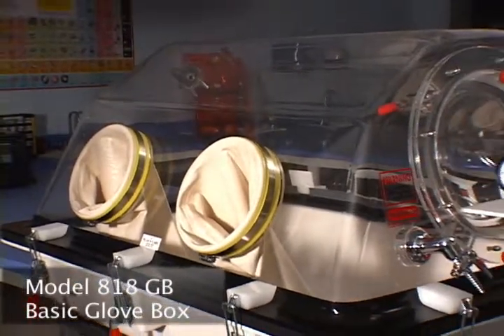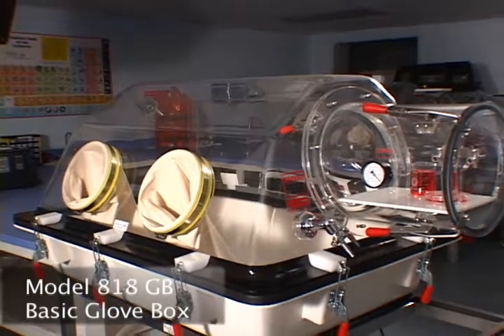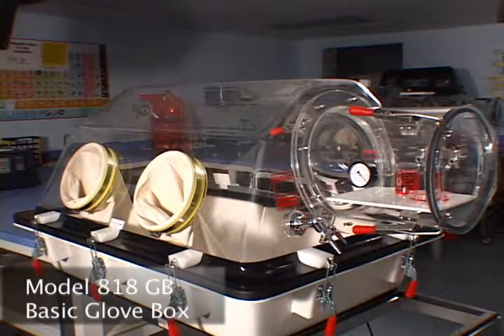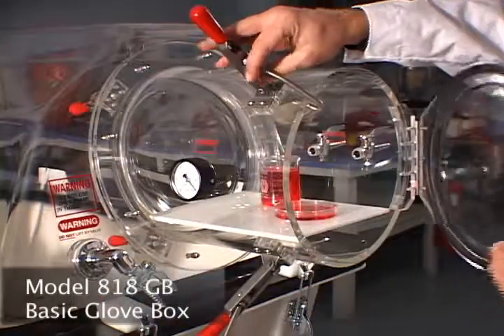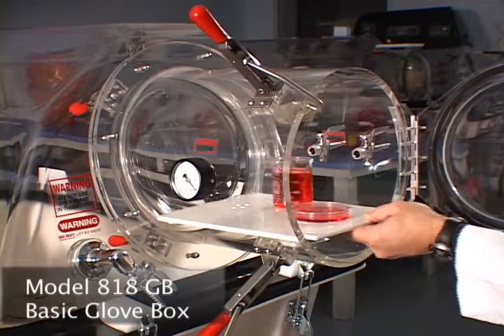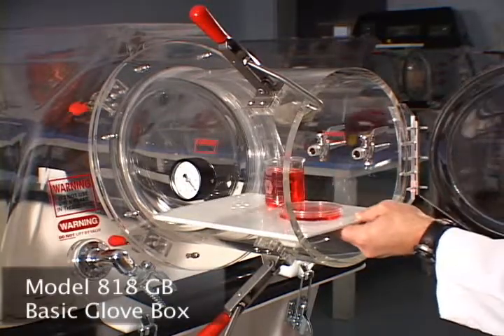The 818GB glove box is designed to be just what it's called: basic. It is our most popular basic glove box. This compact, lightweight unit is very useful for isolating sensitive research studies from a hostile exterior environment.